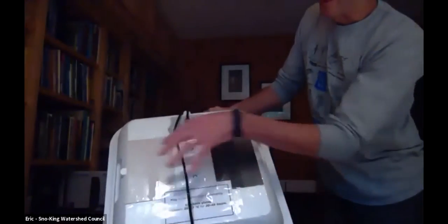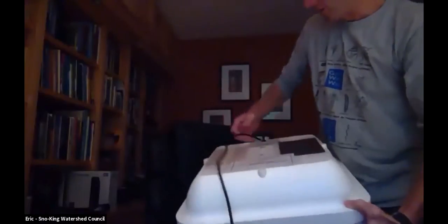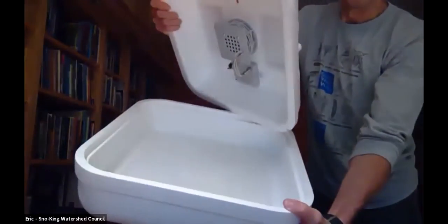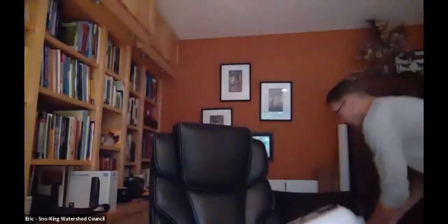It comes with windows. It's an egg incubator, but basically it's got a thermostat. So we just plug this thing in, open it up, and put our dishes inside of it. What's nice about this is you can program it, and we pre-program these with a set temperature, so it maintains the temperature like it's supposed to for the whole time.